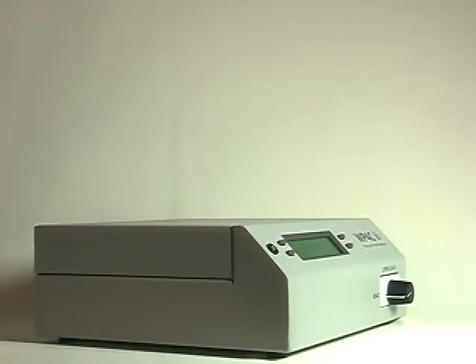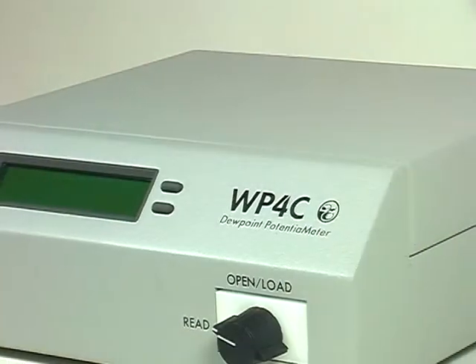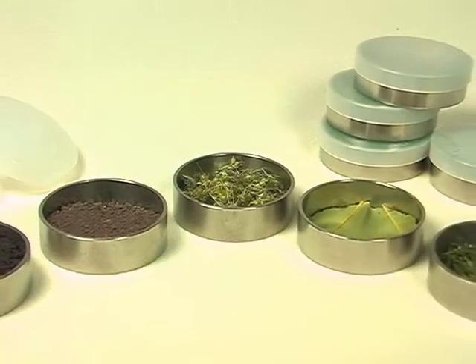The new WP4C dewpoint potentiometer measures water potential in any porous material — usually soil, soilless substrate, plant material, and seeds — but it has also been used to measure apples, bricks, oil, and more.